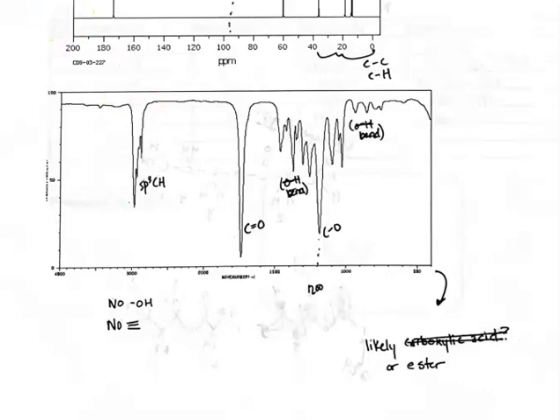In IR, you have your x-axis, which is the frequency labeled as your wave number in inverse centimeters. And on your y-axis, you have the light absorbed, which is labeled as percent transmittance right here. So carbon-carbon bonds are usually nonpolar and are not going to show up as peaks in IR. So what we're looking at mostly is carbon-hydrogen bonds and the carbon-oxygen. We'll start here at the top. At this 3000 mark, this is going to be denoting an sp3 hybridized carbon-hydrogen bond group.